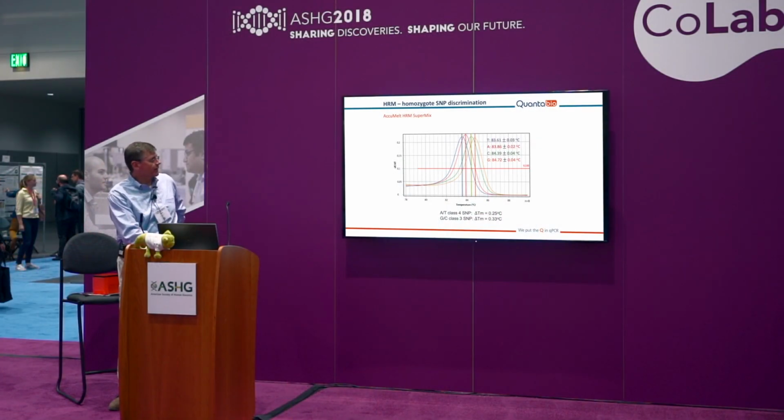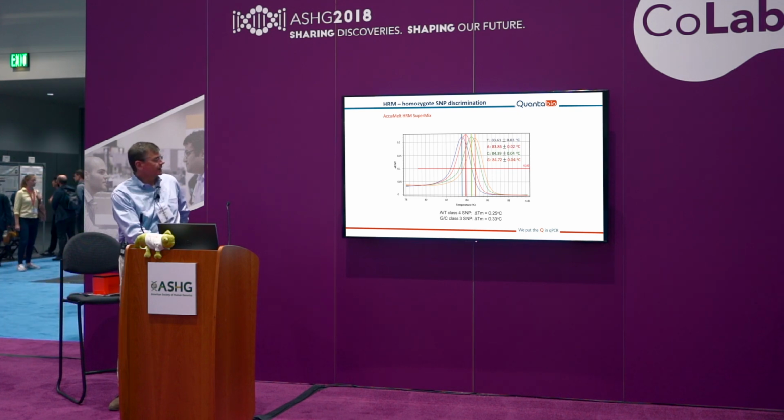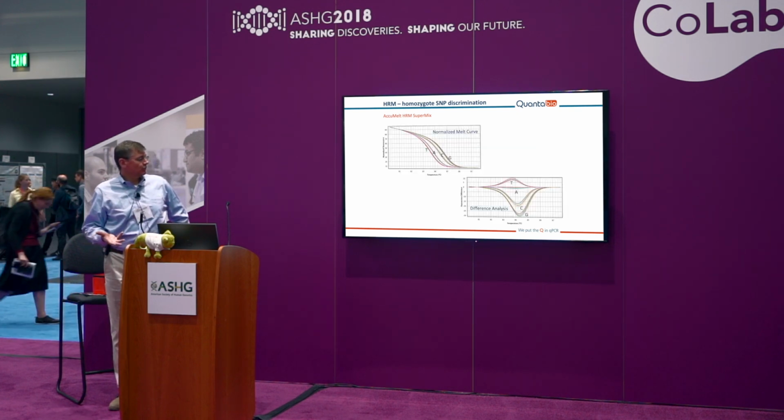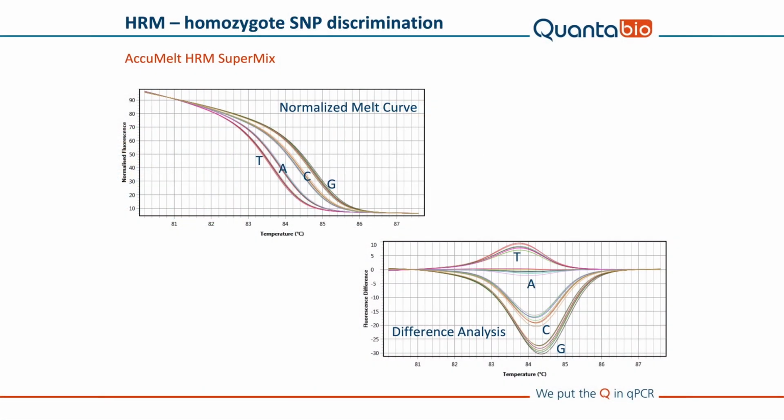And a similar situation looking at a class 3 GC SNP. Now, if you do get the HRM module, there are other classic normalization routines included for normalized melt curve or difference analysis, and you can see the 4 alleles readily pop out.